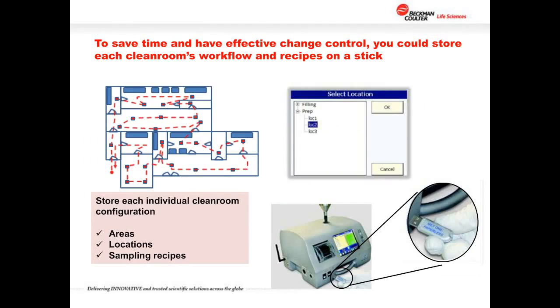So one of the things that's possible is to use the electronics of a more sophisticated counter to help out in the process. Many counters today have, in essence, a small computer built into them, almost like a laptop built onto a particle counter.